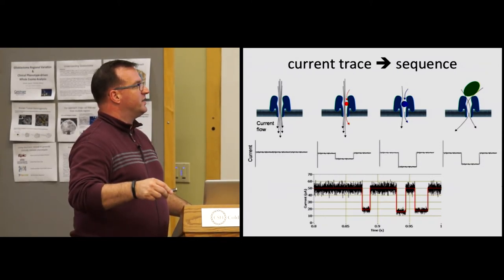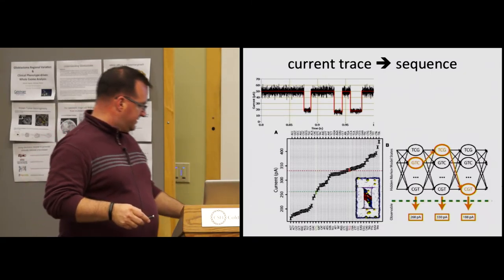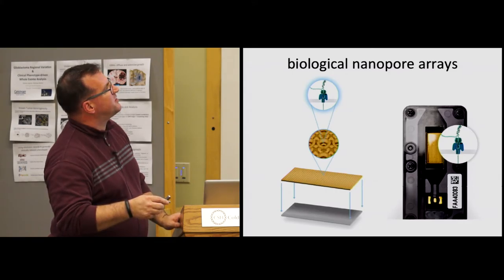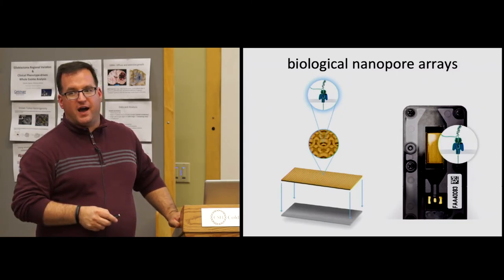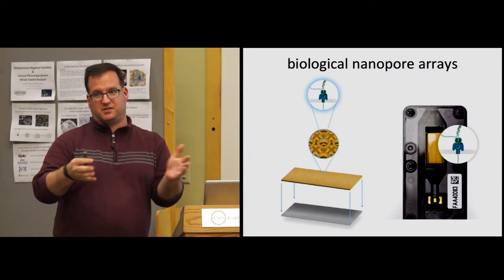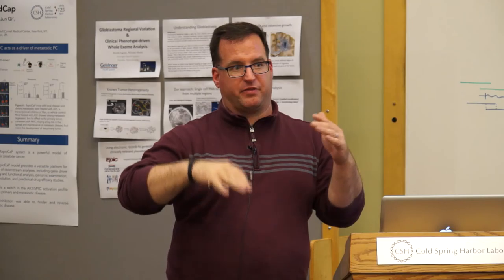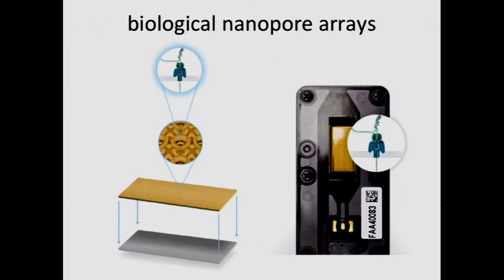Because essentially, what is this little blurb? Those blips have to do with sequence. Well, the idea is, and I guess you see it here a little bit better. So if you have a double-stranded DNA sequence, and if you can get that DNA sequence to unwind with a helicase or some kind of reaction, or just like in an electrophoretic gel, just using the electric potential to drive the molecules, the only way they can get through from one side to the other is to go through the pore, and the pore is only big enough to allow single-stranded DNA to go through.